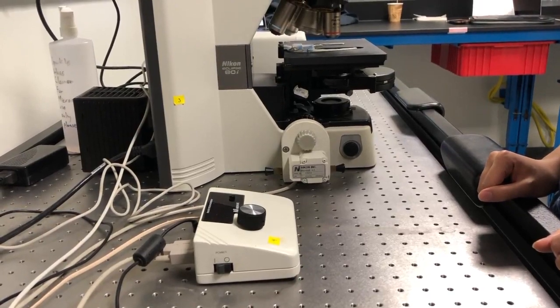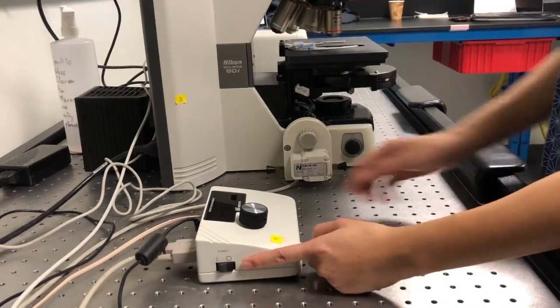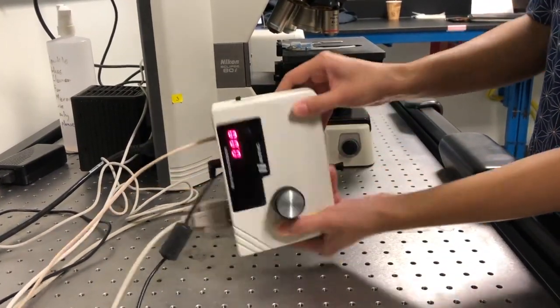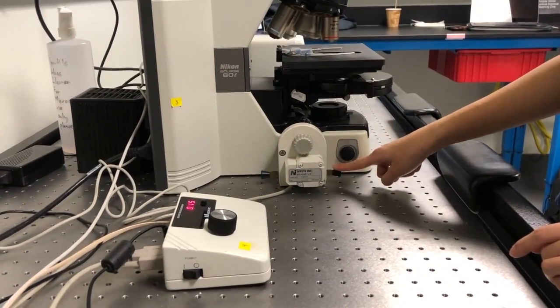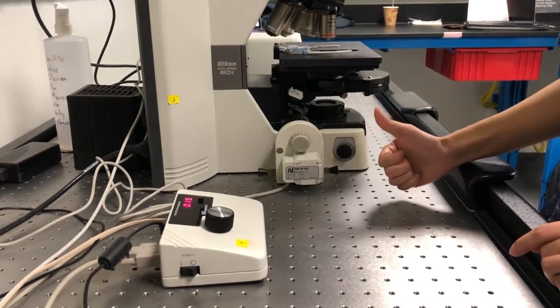So, to turn on the remote focusing control, this is the white box to the left of the scope, power toggle is on the left side, and sensitivity on the right side. Note that this will only work if the gear is engaged. This is disengaged, and this is engaged.